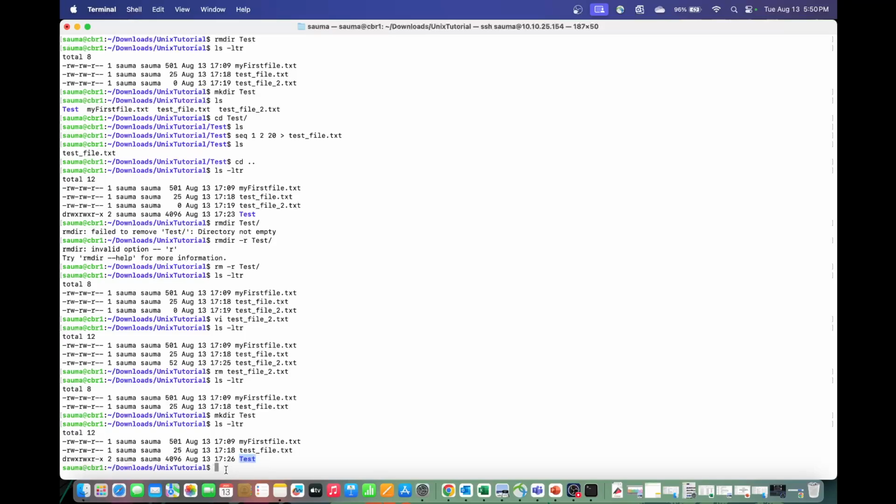Right. So the command is cp for copy and mv for move. I'll come to mv as well. So cp copies a file from one place to another. What is the command? cp space the name of the file with the location. Since I'm within the directory, it's the same location, just the name of the file. cp, name of the file. I do a copy paste here.